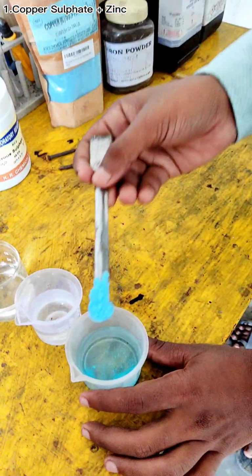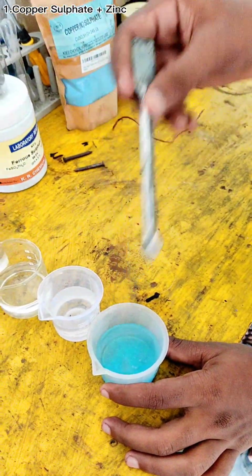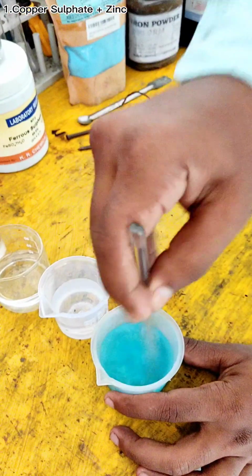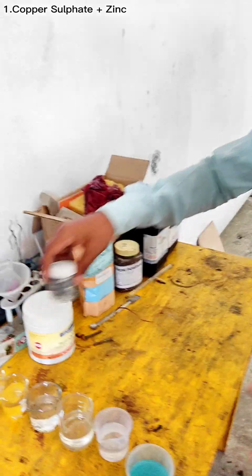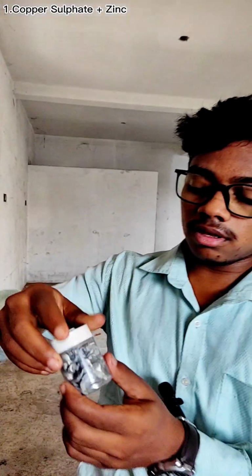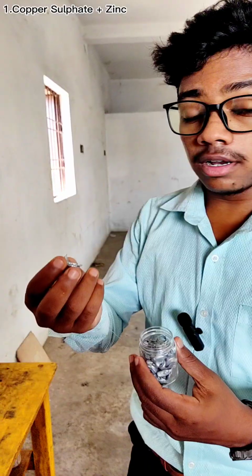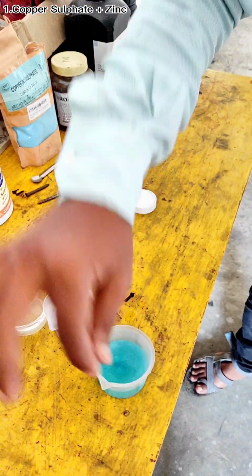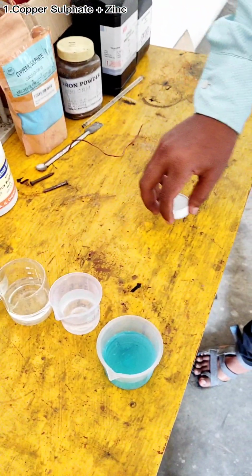As we know that copper is less reactive than Zn, so Zn will displace the copper metal in copper sulphate solution. Copper sulphate solution is blue in color, and this is our zinc granules, zinc metal. Let me add 1 granule of zinc, and we will leave the reaction for some time.